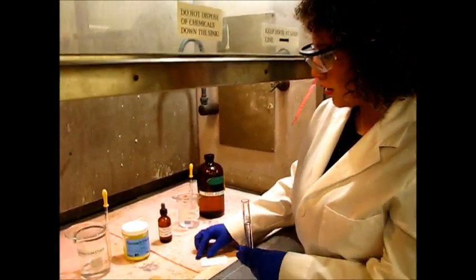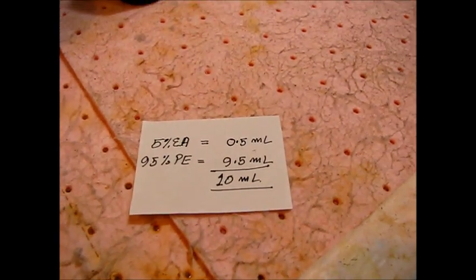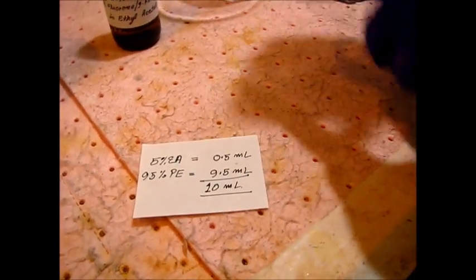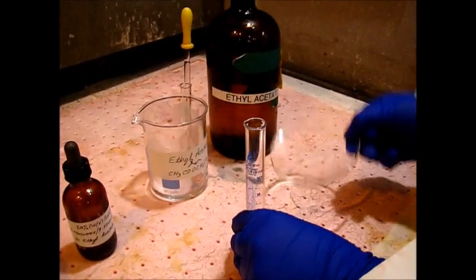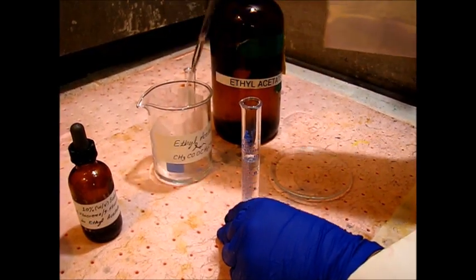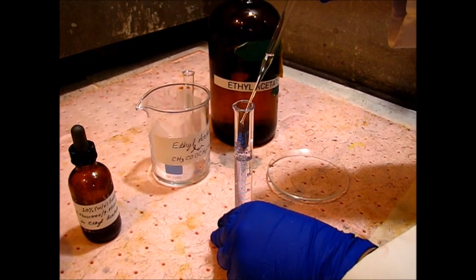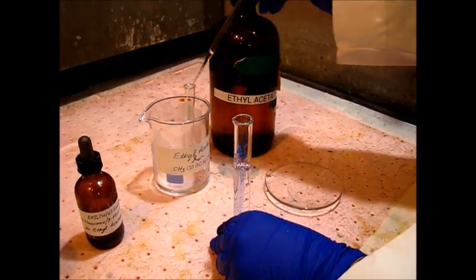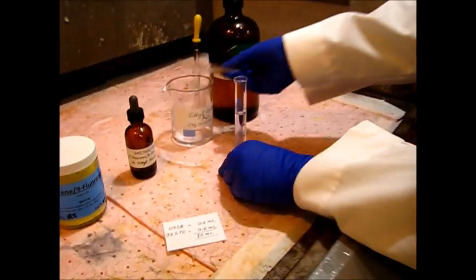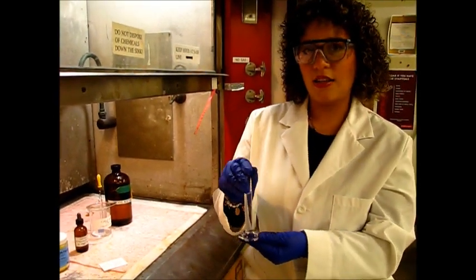For beaker 2 we have to make a 5% ethyl acetate concentration. I have already measured out 9.5 mLs of PE and we're going to top it off with 0.5 mLs of ethyl acetate. So we reached our 10 mLs. Here we have our 95% PE and 5% ethyl acetate.